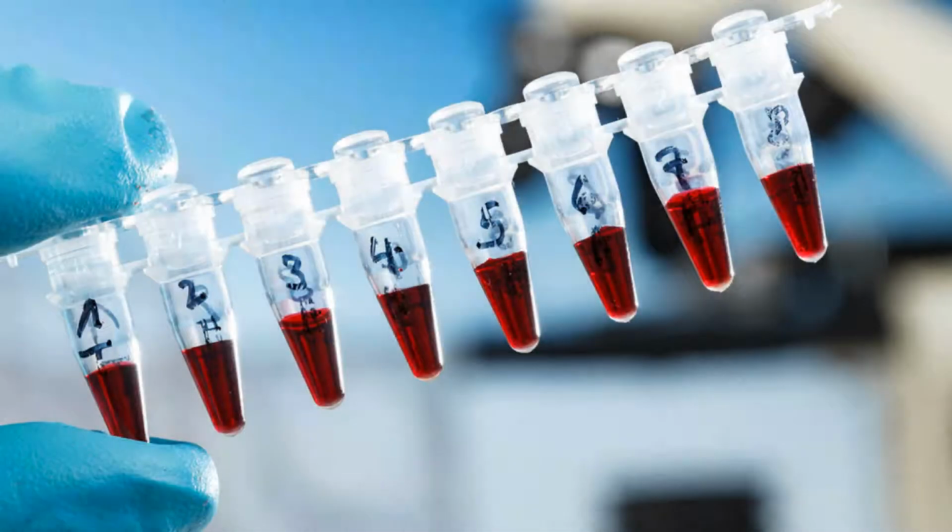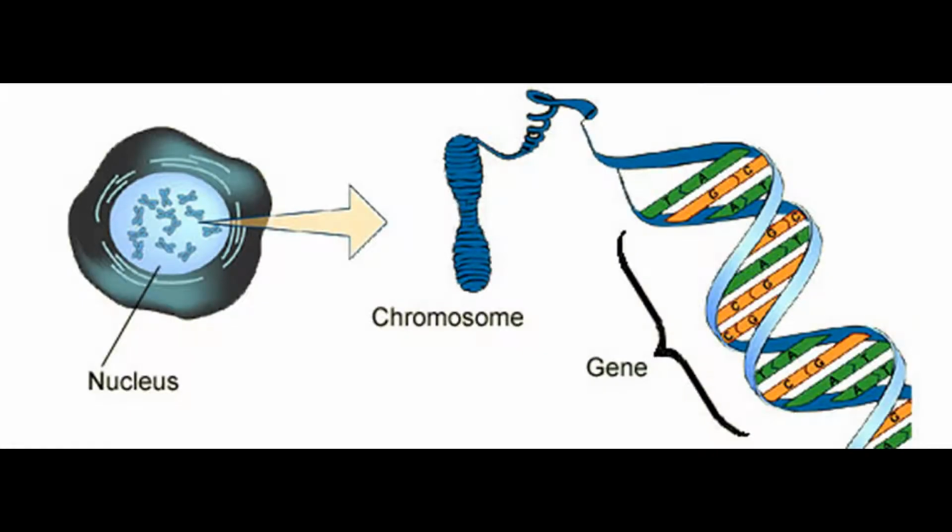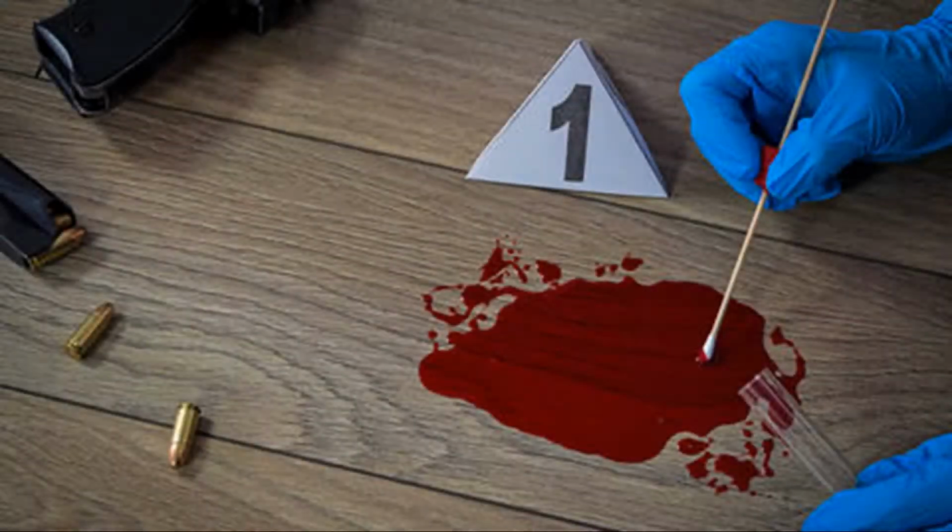Kung anong gusto ng molecular biologist. Okay, so for example, it might be a gene, yung segment ng DNA na yan. It can be a gene whose function a researcher wants to understand. Or it can be a genetic marker used by forensic scientists to match a crime scene DNA with suspects.